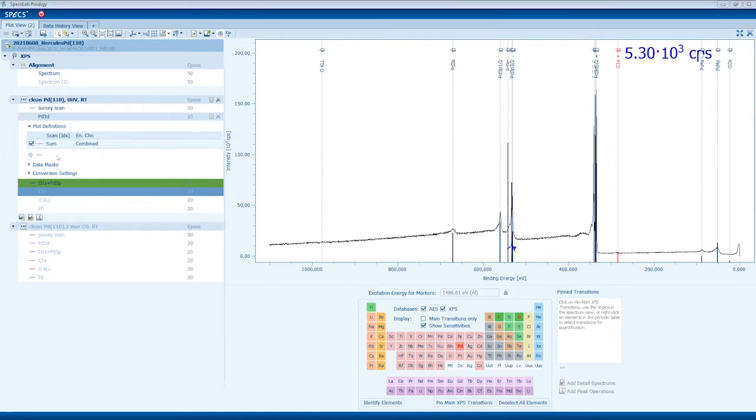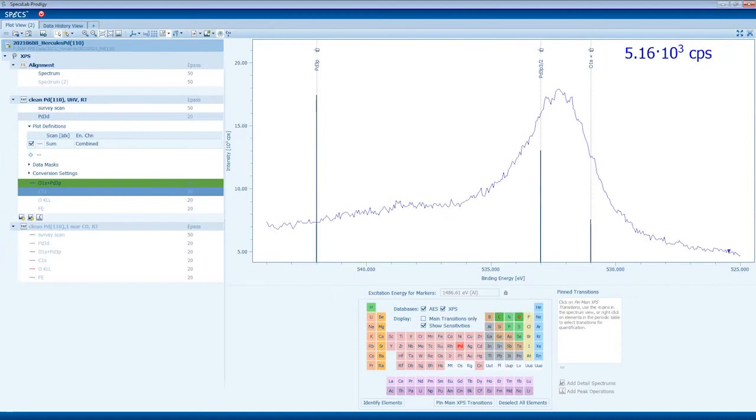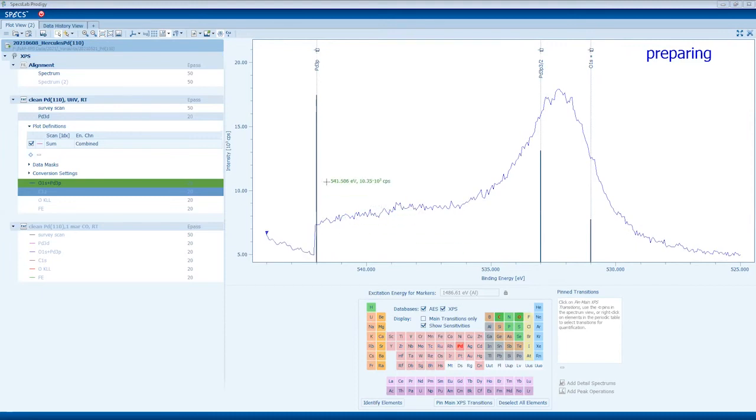And it should be a long window because we want to see the gas phase, which is the higher binding energy, and also the adsorbate on the surface. As soon as we introduce some CO, the gas phase should be somewhere a bit higher, 535, I believe, or something like this. I think the gas phase will be a bit apart from this palladium.